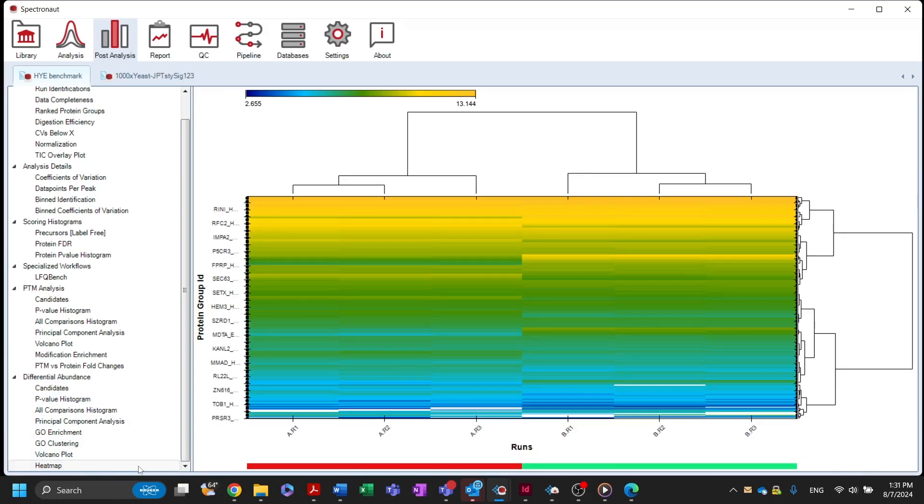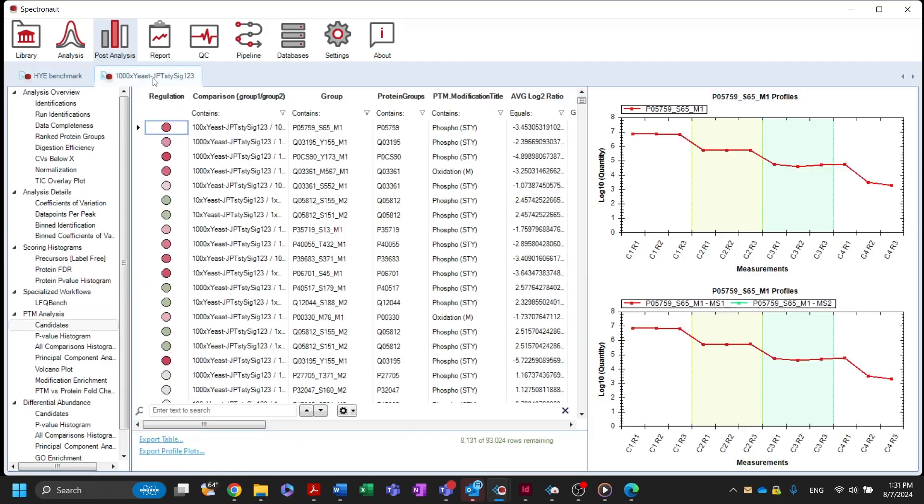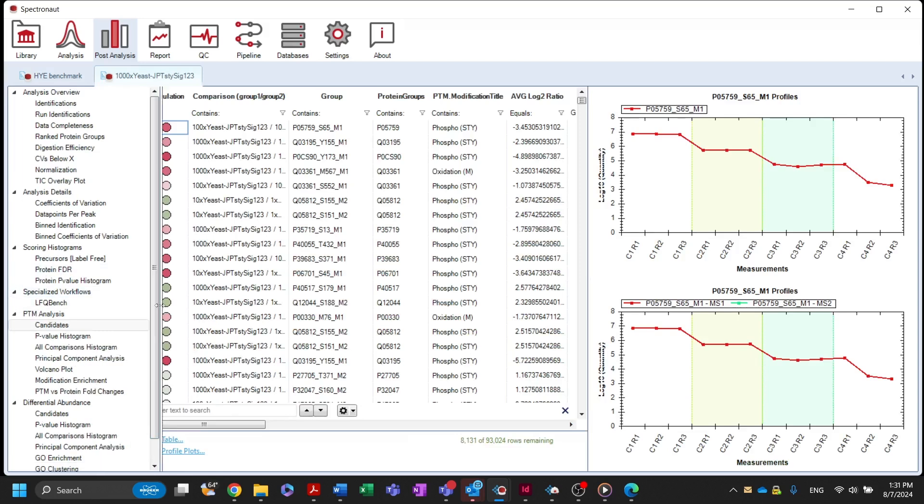Similarly, for experiments where the PTM workflow setting is enabled, the results of the differential abundance testing on a modification site level will show up in the PTM analysis section.